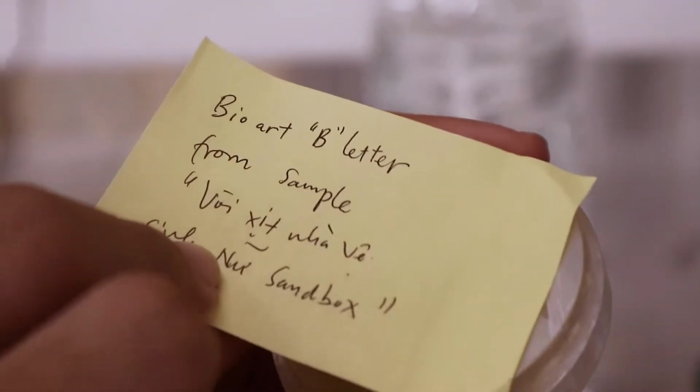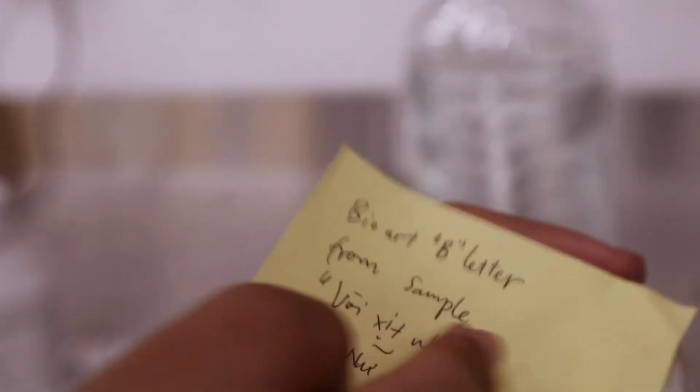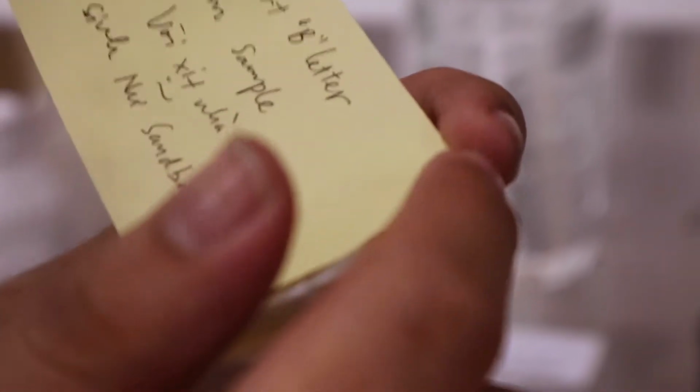Okay, we have labeled this using a sticky note, because we do not have many resources. But it's a good practice to label everything you've done very carefully, so you won't forget anything. And before that, we have wrapped it in parafilm, remember?